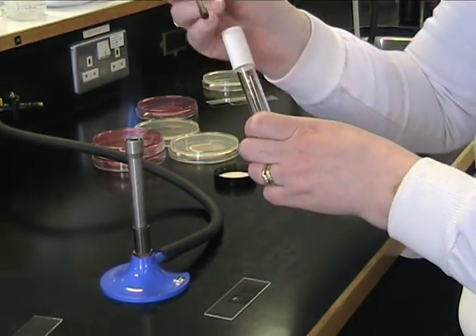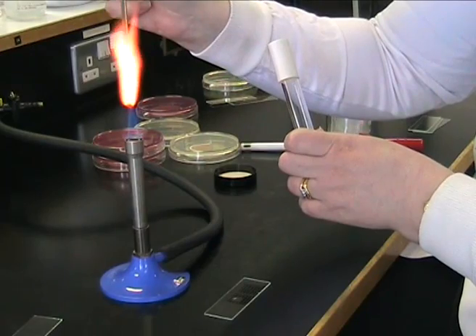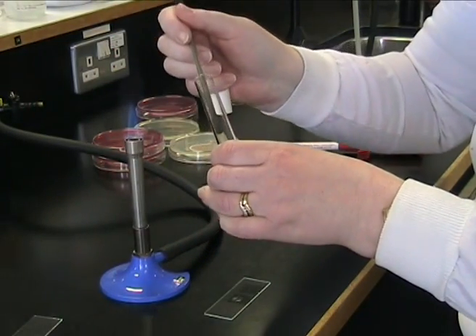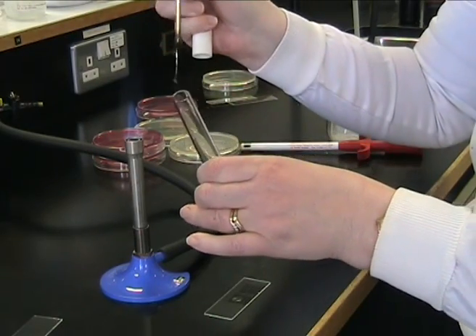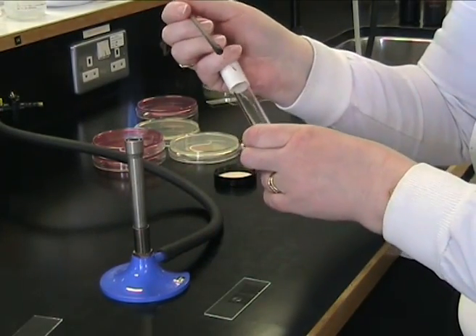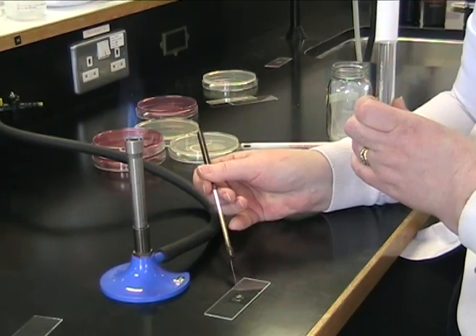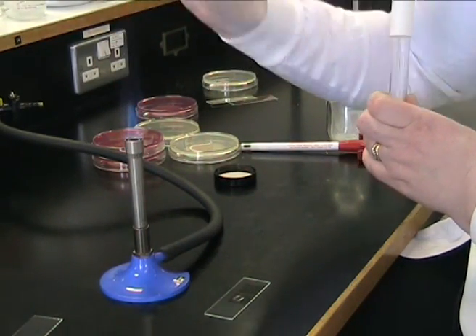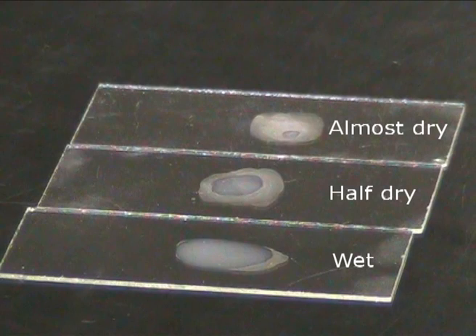Repeat this process: flame your loop, flame the neck of the test tube, take your loop full of broth, flame the neck, put your drop onto the slide, and finish by flaming your loop. Allow your slide to dry naturally in the air.